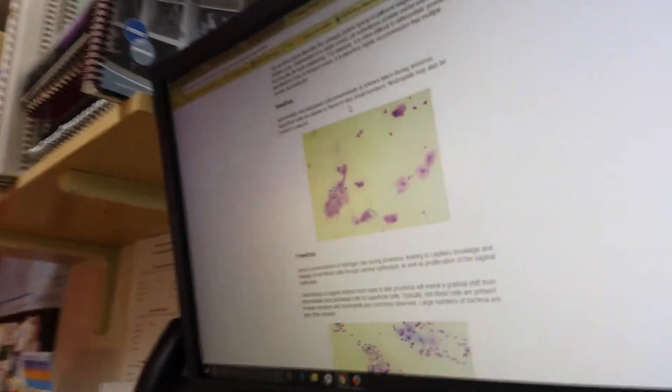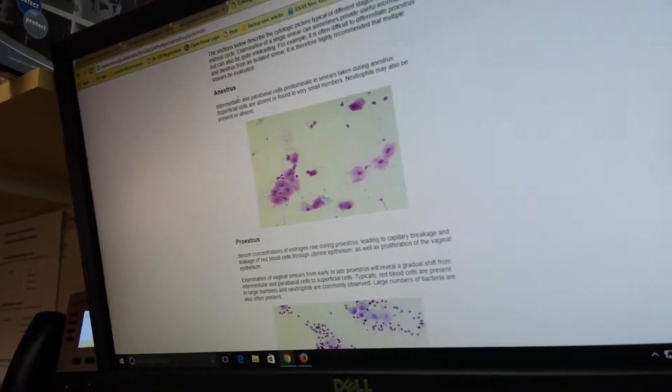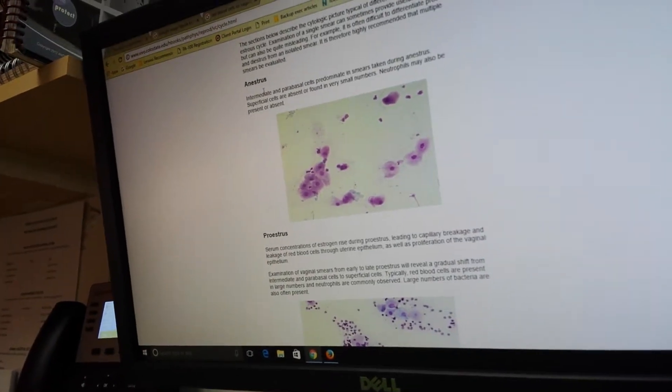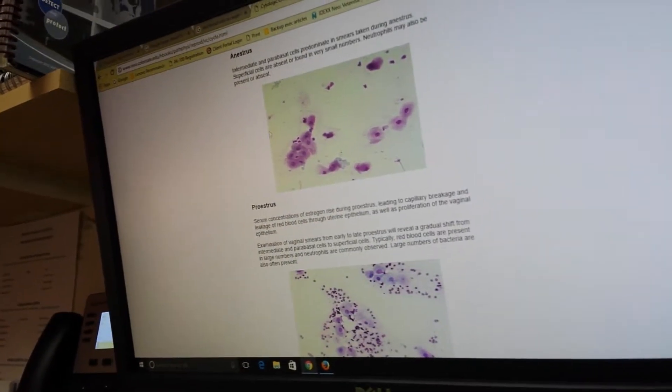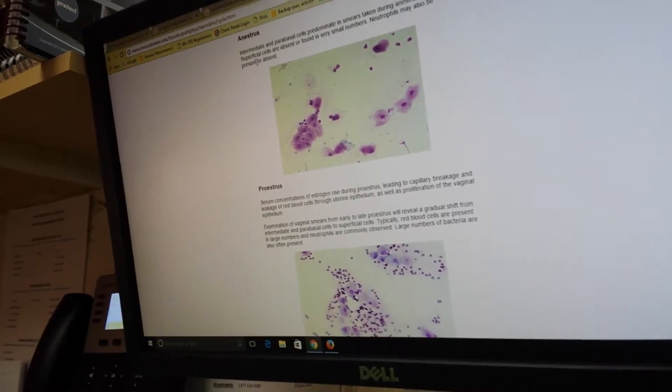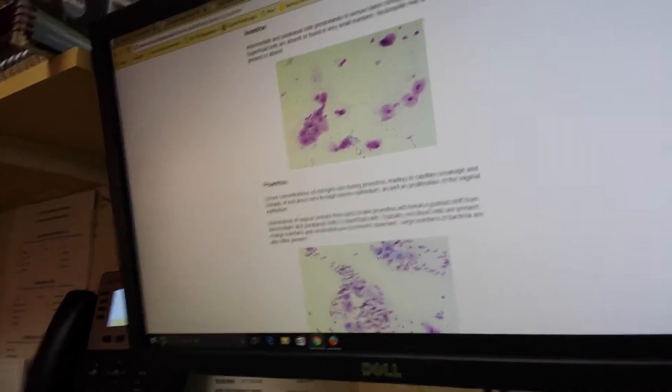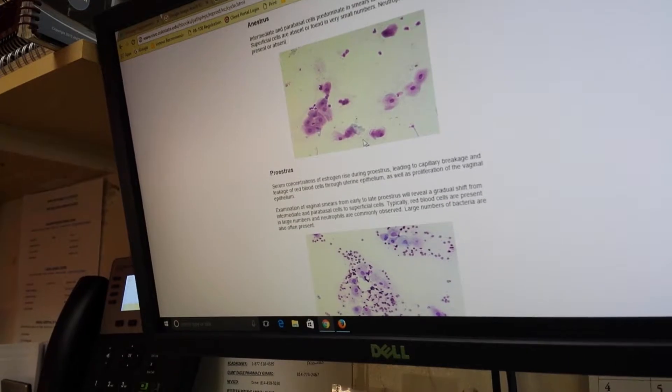And then as for the stages of estrus, the first stage of estrus is the anestrus. So you would just see a few superficial cells, you might have a few neutrophils as well, but as you can see there's not a whole lot going on in that slide.